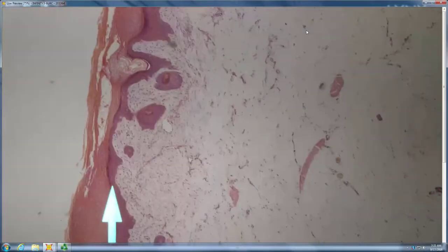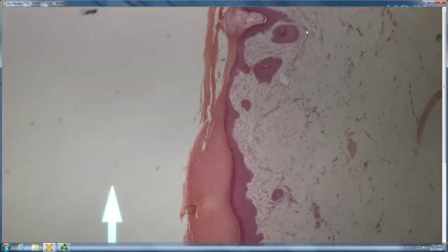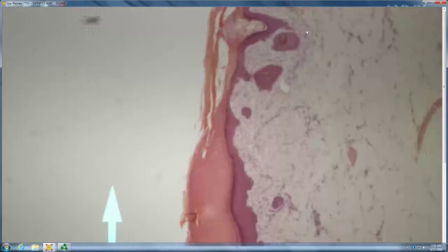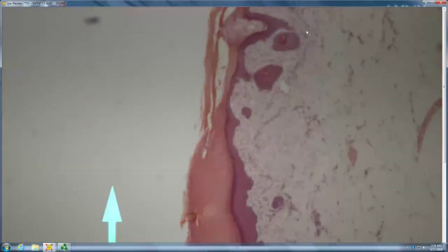Dr. Johnson, it seems a little bit dimmer than it was earlier. Is the polarizer on or something? I am not sure what happened here. Let's see if we got something. There, there we go. Yes, the polarizer got bumped in. Thank you.